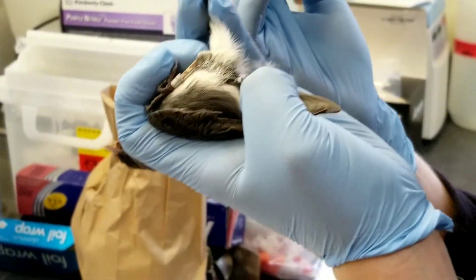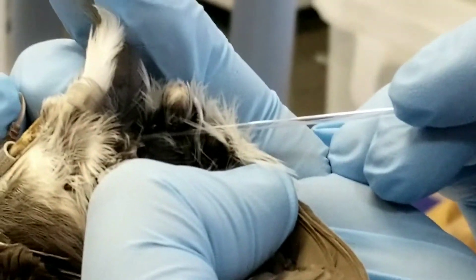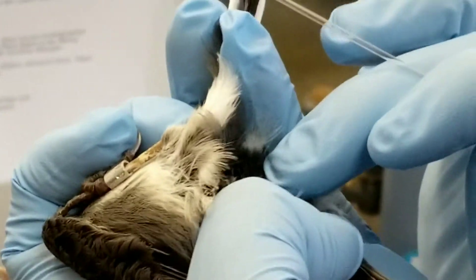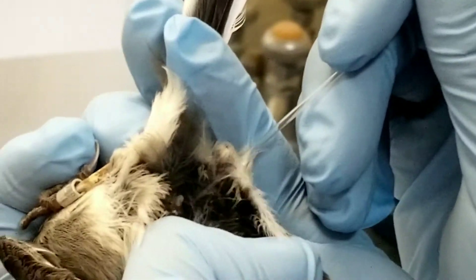You're going to blow on it, and in behind you're going to see the preen gland right here. Now this is the largest exocrine gland in a bird, and it secretes something called preen oil. If you see this tip right there, that's where the preen oil comes out of.